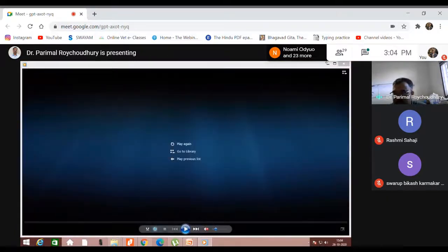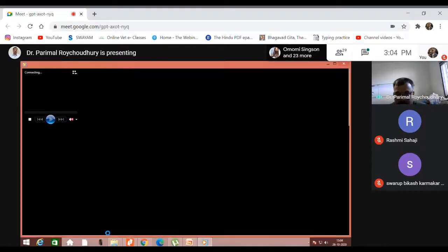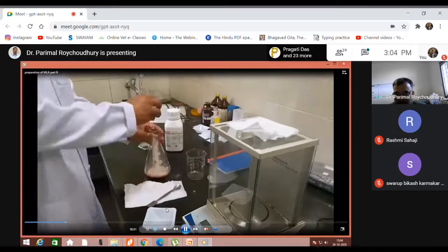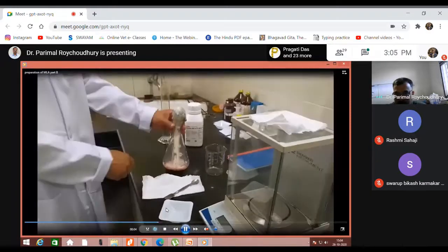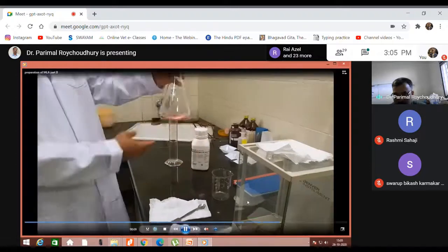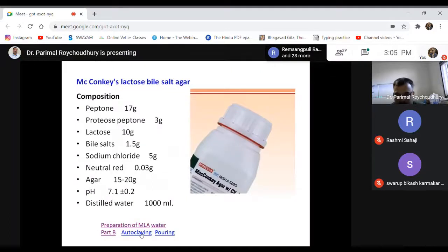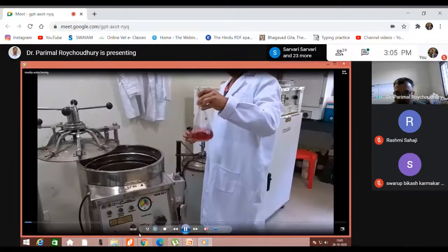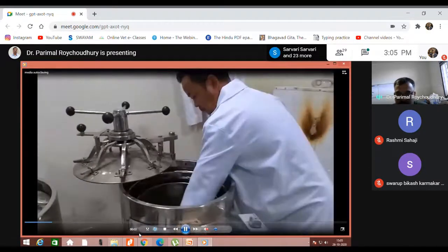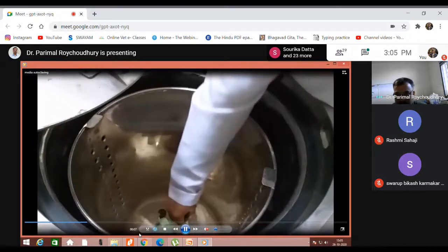Let us take another clip here. Yeah, part B. Then we are going for the preparation of another very special media. It's called Robertson cooked meat broth. It's not this video. Okay, once we check everything, then we keep it in the. This is another media. The video is missing here.